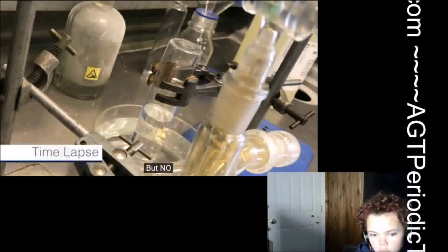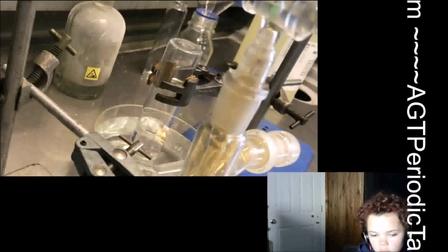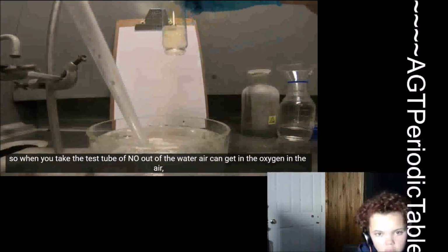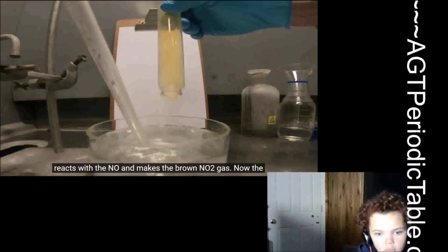But NO reacts very easily with the oxygen in the air to make NO2. So when you take the test tube of NO out of the water, air can get in, the oxygen in the air reacts with the NO and makes the brown NO2 gas.